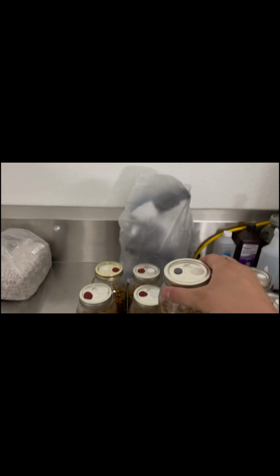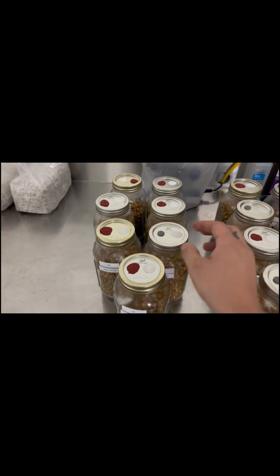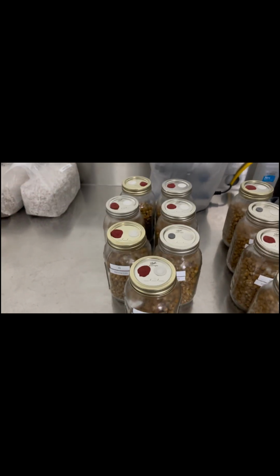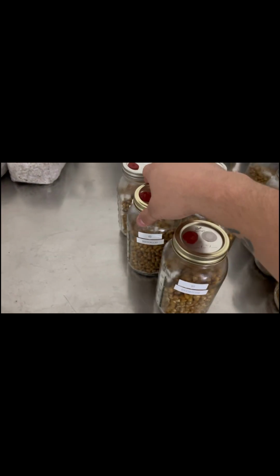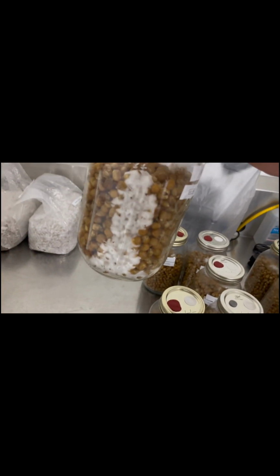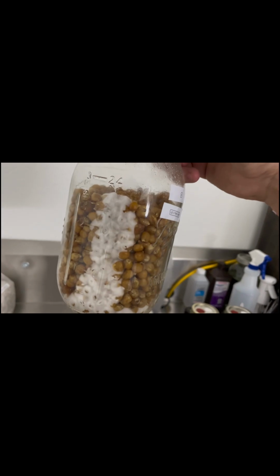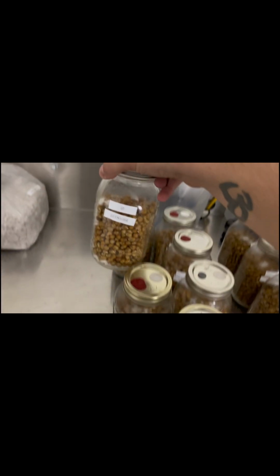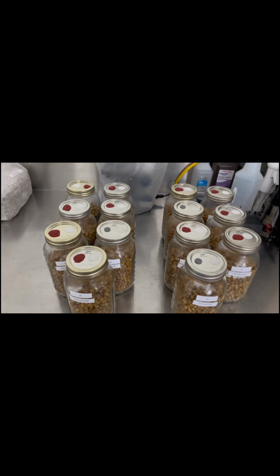It's been a week. I don't keep my room all that warm. It stays around 70, maybe a little bit under. And this liquid culture might just not be super aggressive, but anyway, we got kind of the same thing going on there. Sprayed it in the middle, got growth on the bottom. Some of these other ones where it's sprayed on the side, it looks like there's a lot of growth, but the other ones could have just as much. It's just hidden. But anyway, that's the 1 week checkup, and I'll be back in a few days.